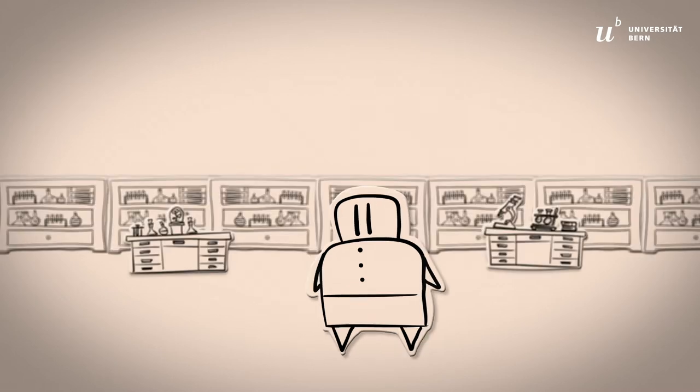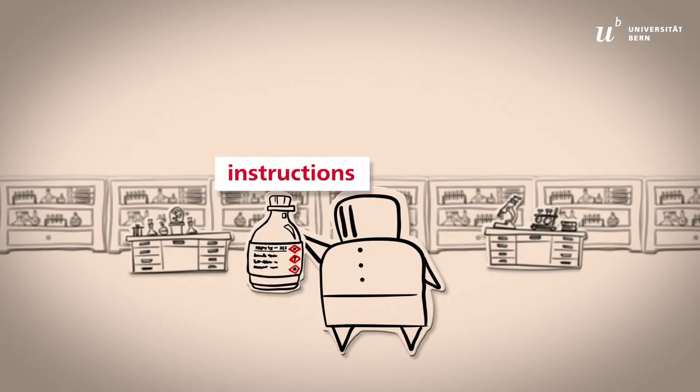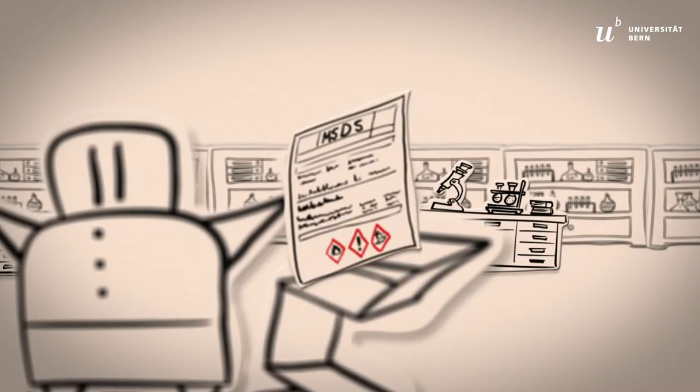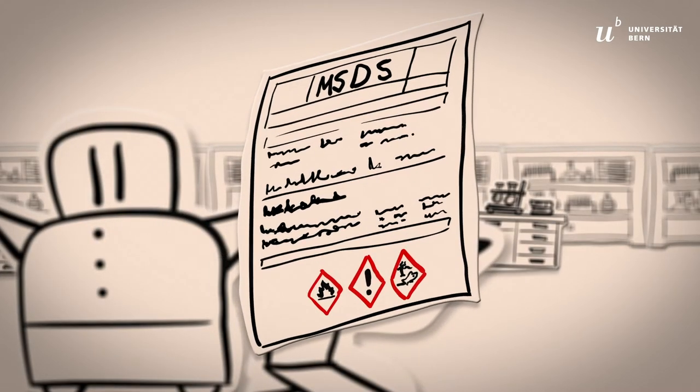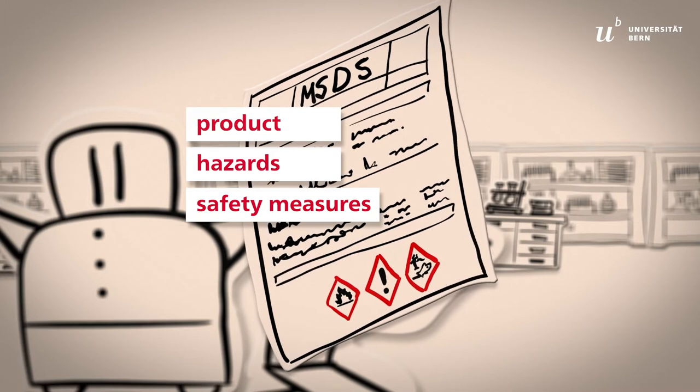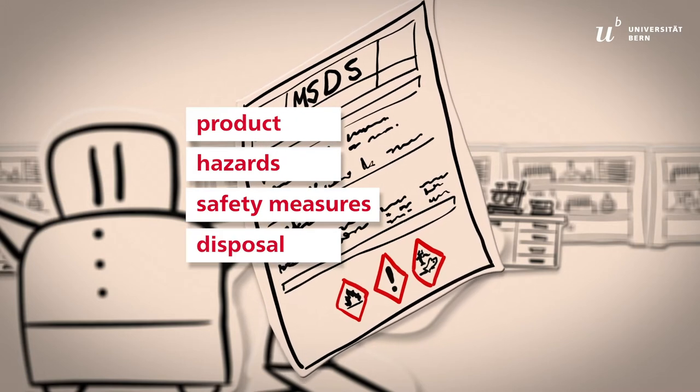To use a chemical in your work, you must follow the instructions given on the container label and the corresponding material safety data sheet. The sheet also contains information about the product, its hazards, the corresponding safety measures, and how to dispose of the product.